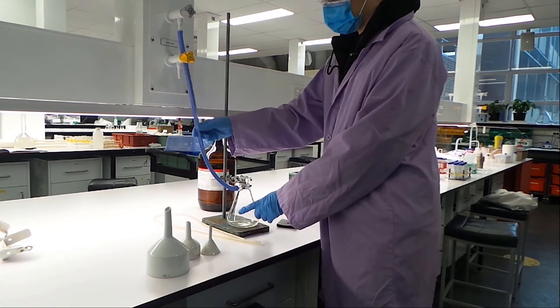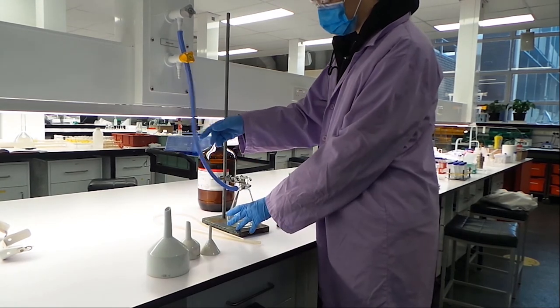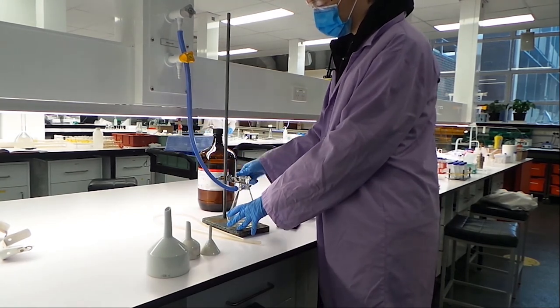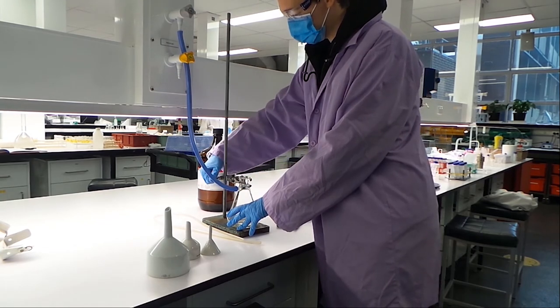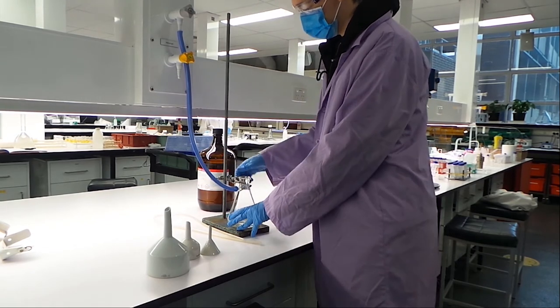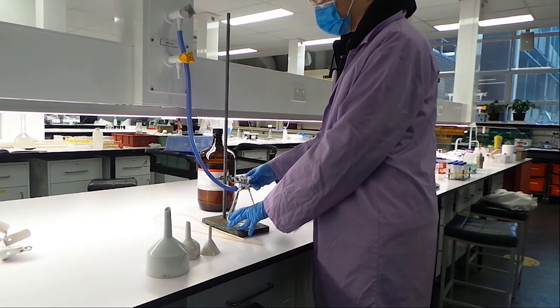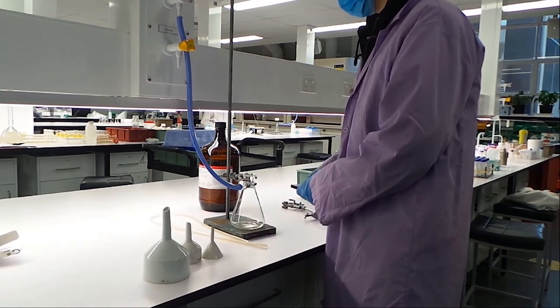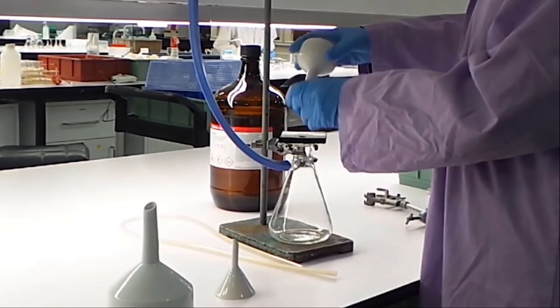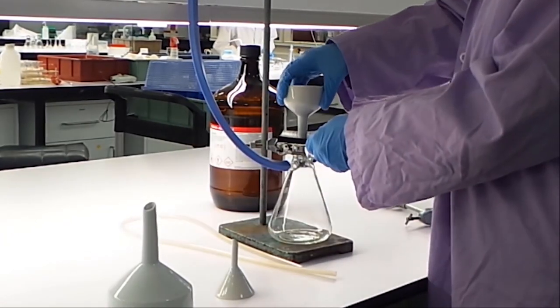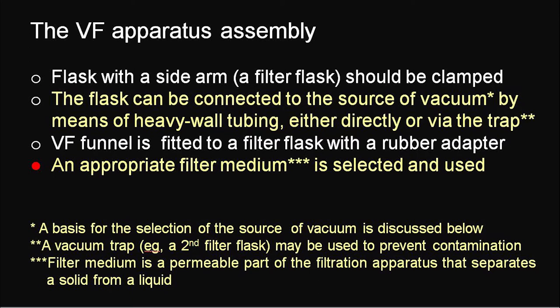Once a funnel is chosen, you will need to secure your vacuum flask so it does not fall over once the vacuum is on. Use a retort stand to do this. Once secured, you can put a rubber mat between your funnel and your flask to make sure it is sealed.